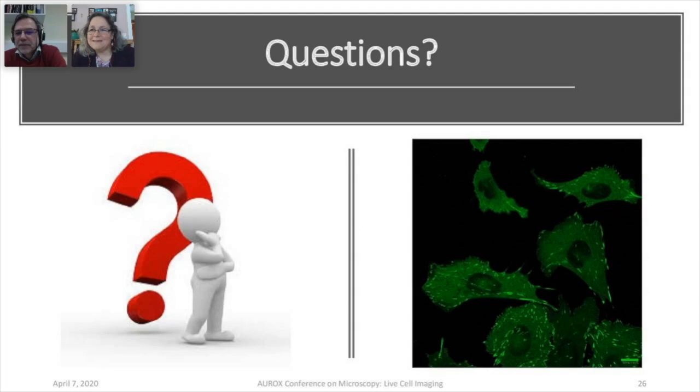I think there was one from Jennifer Coolhay: did you compare the shuttering of different LEDs with each other? That was right back at the beginning of your talk. Yep, that's great, thanks. No, we didn't. These were all done with the LED 120 from Excelitas. But that is our plan right now, when we get back in the lab eventually, to look at different LED light sources and even the same LED light sources on different software platforms, and really dig into that to see if it's highly variable or whether there are certain constants. Like the electronic shuttering should be the same for a given light source regardless of the operating system. But these software delays, I think you'll find, will vary between acquisition software platforms.